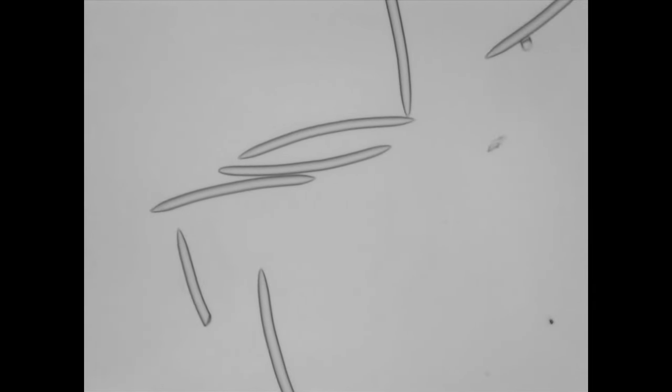So this is our first sponge and as I look at the slide I can see mostly oxias. They all have a very similar shape and length and width. These oxias are basically small curved rods with a point on each end.